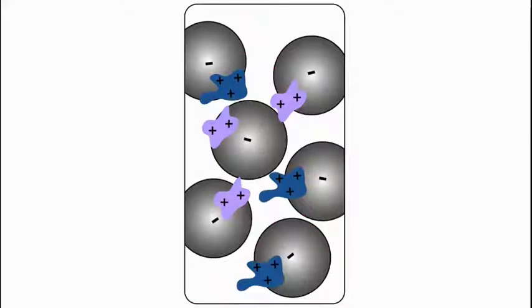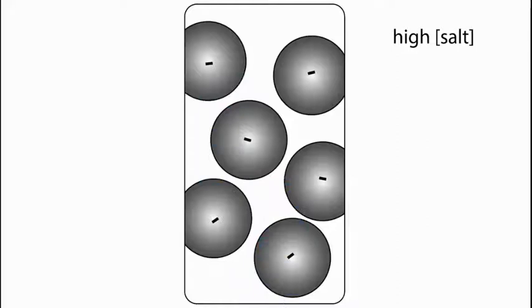So I change from a low salt buffer to a high salt buffer. That high salt concentration helps to shield the charges on that column. And that now allows the proteins to come off. Now, the one that has the fewest of the positive charges is going to come off first. So this guy comes off first. That's the purple one. And then the other one comes off later. So even two positively charged proteins can separate on this column depending on the salt concentration that I use.